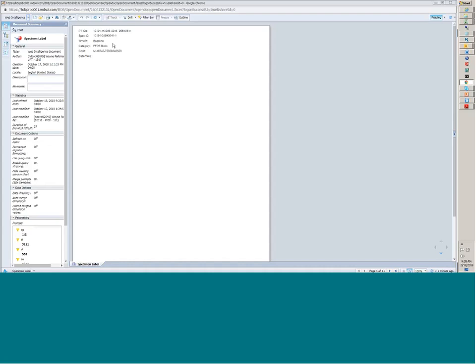So on this label, we do have the patient ID concatenated to the protocol number itself. So this first field is showing one identifier, patient 48. And then there's also the universal patient ID. So there's just a space in between. This line is called the patient IDs. We've got 2 of them here. Lots of information on this one line.